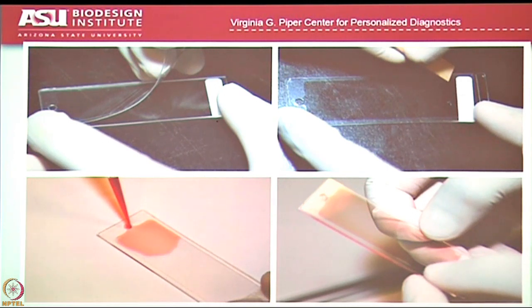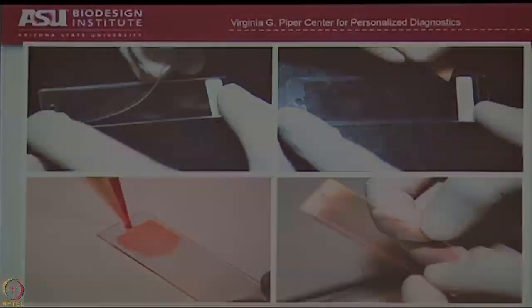So this is how we actually make the chips, and I think you guys have examples of this at your desks. You have this cover slip here that you put on the chip. There's a little hole here and a little hole here. You inject your lysate in here, you fill it all up, make sure you don't get any bubbles. That's always the trick, one of the things you have to learn how to do. And then you can make the proteins on the chip using this approach.